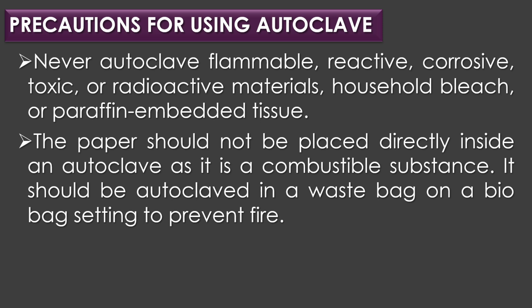Besides, never autoclave flammable, reactive, corrosive, toxic or radioactive materials, household bleach or paraffin embedded tissues. Paper should not be placed directly inside an autoclave as it is a combustible substance. It should be autoclaved in a waste bag on a biobag setting to prevent fire.